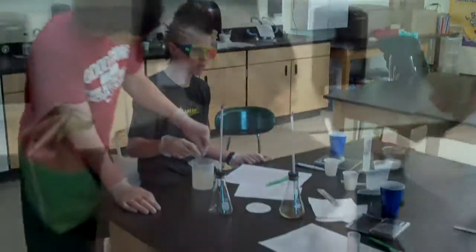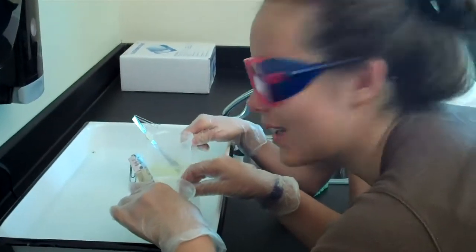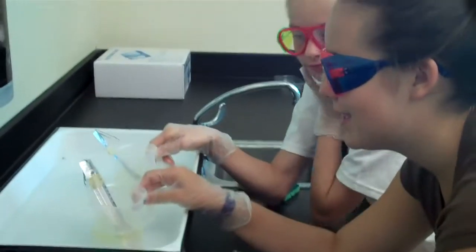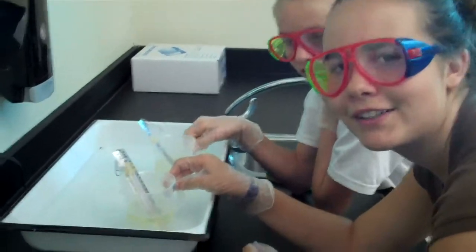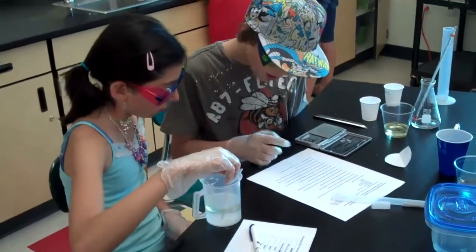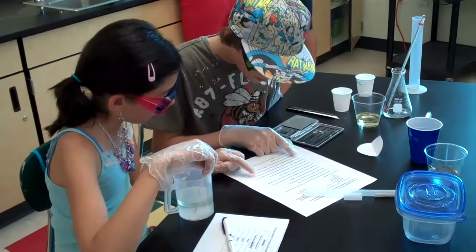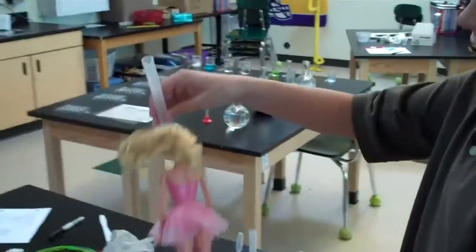Tell me what you're doing, girls. We're heating up our citric acid to put into our shampoo. We have 20 tests to see if we can get oil out of Barbie's hair. We put oil in one side and we're testing our shampoo.